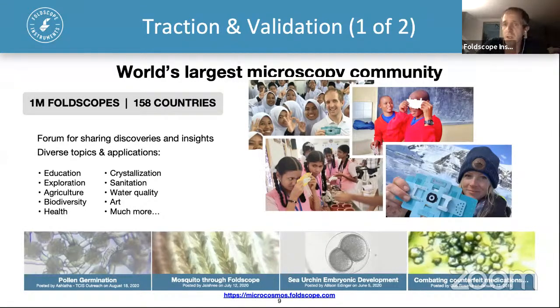Also, applications within chemistry and even different physical sciences, crystallization, just by taking salt, different types of salts, or just sedimenting out, looking at the sediments from, maybe you can do centrifugation and look at the sediments from that on a glass slide, and you can really learn a lot from a specimen using those techniques with microscopy.